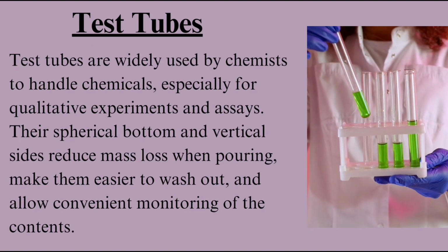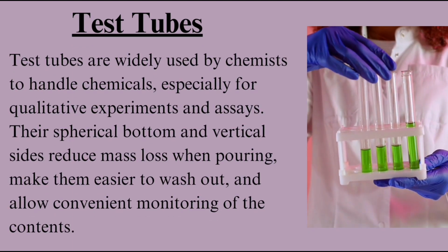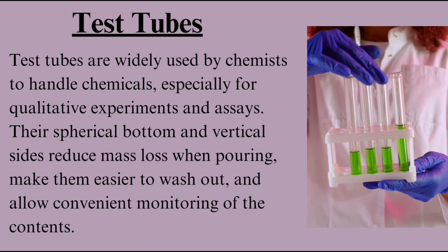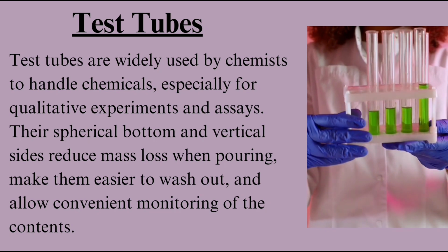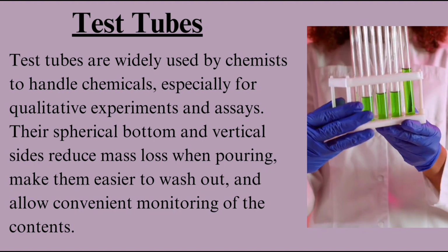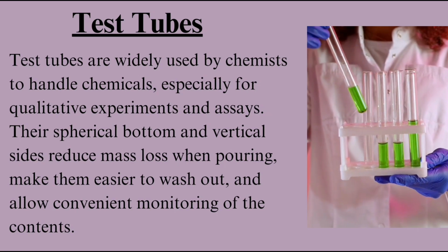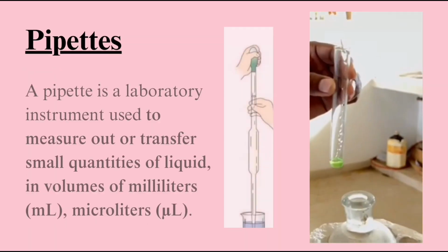Test tubes. Test tubes are widely used by chemists to handle chemicals, especially for qualitative experiments and assays. Their spherical bottom and vertical sides reduce mass loss when pouring, make them easier to wash out, and allow convenient monitoring of the contents.